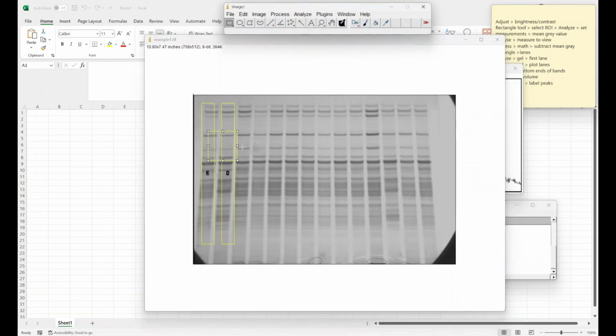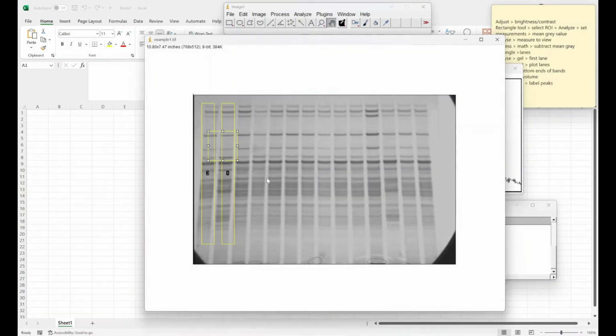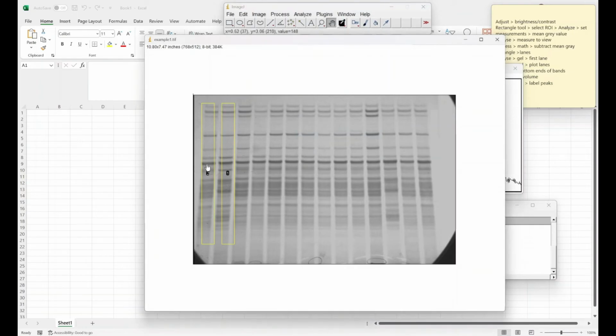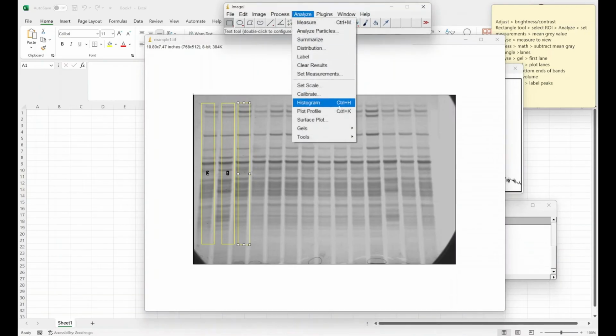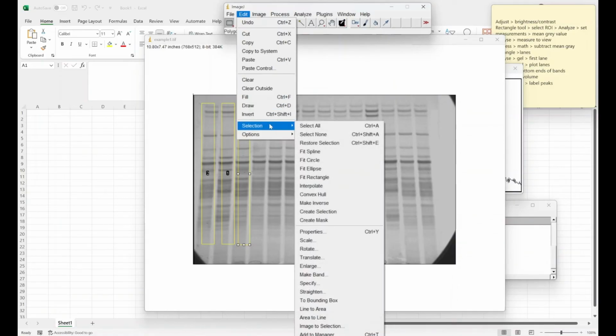So if I want to select all the lanes within this image, I would have to manually come across and define all of those. And now if I click delete there, I've ended up with select none. Okay. So then if I draw another rectangle, can I select that as the next lane? Right, so all selections must be the same size. So again, that's not a prerequisite that's required in Phoretix 1D. You can use lanes of different size.